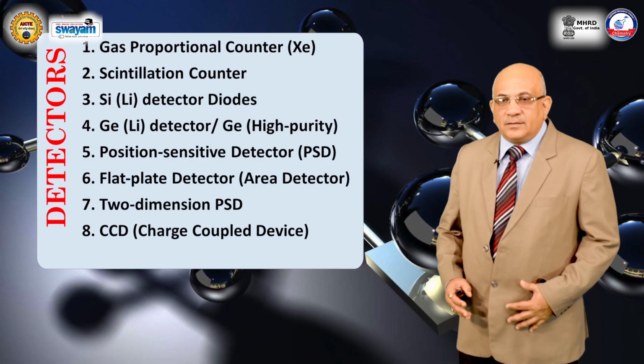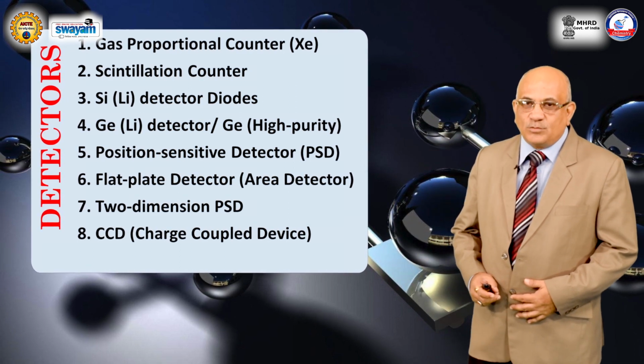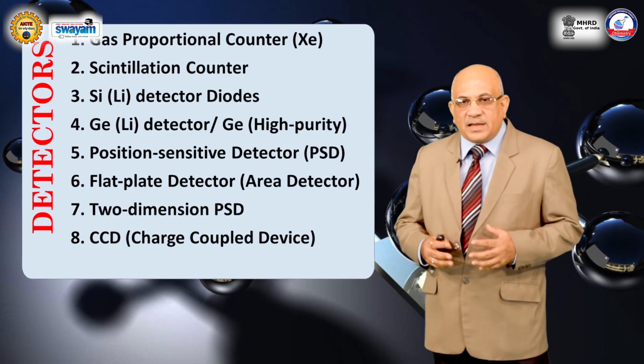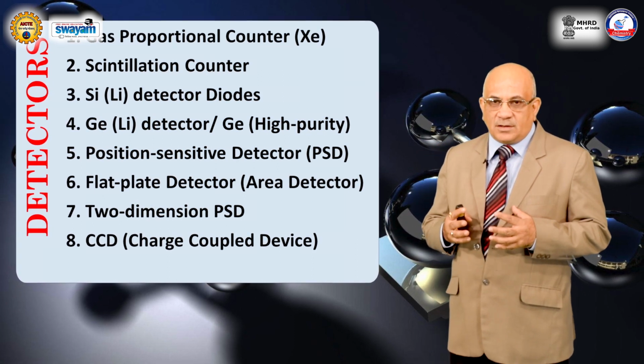In the previous module on X-ray diffraction 1, we had discussed the powder X-ray diffractometer, which is primarily built from three basic components.